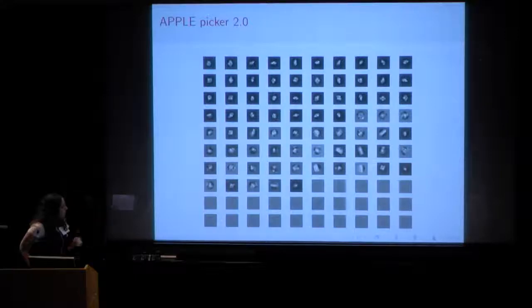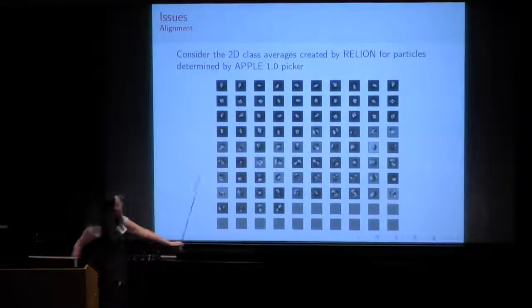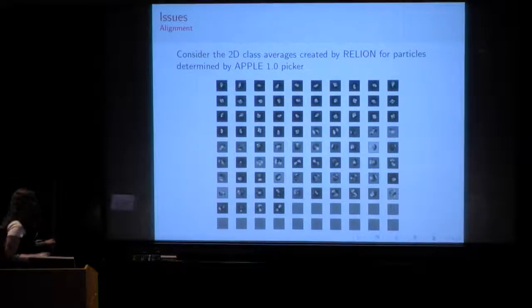So what we created is this new procedure that estimates the location of the center of mass, and it does a pretty good job, good enough that we were able to take all of these particles and move the alignment so that we throw out one of the particles because we can't get both of them, but we do keep one of them at least.